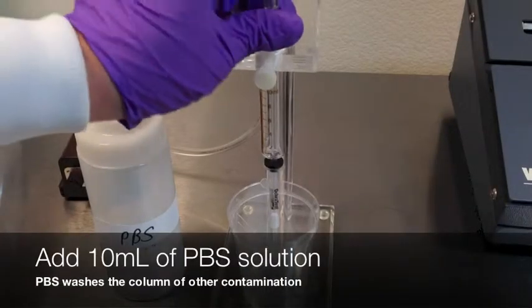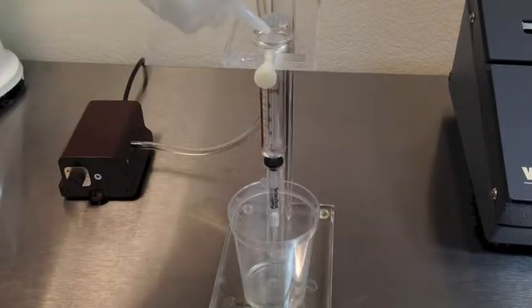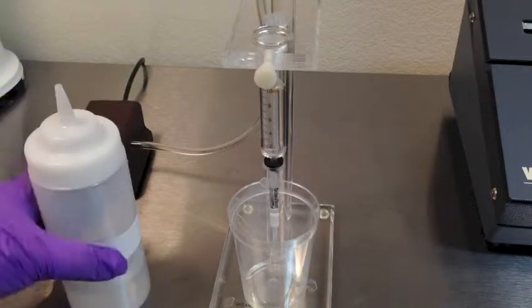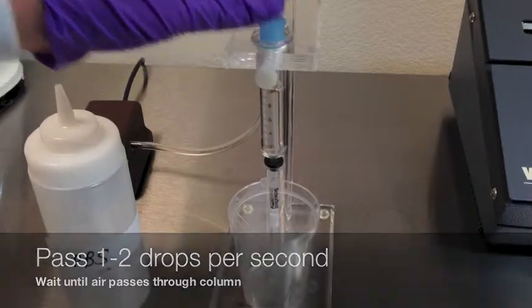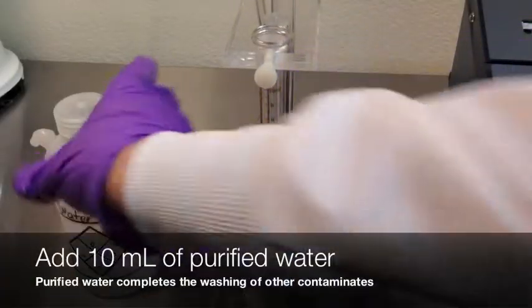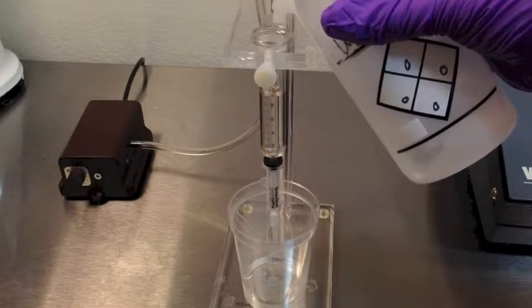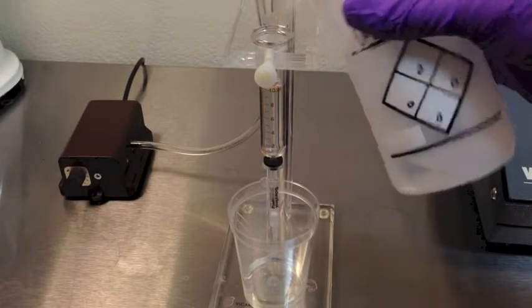Pass the extract through the column at 1 to 2 drops per second until air passes through. Then add 10 milliliters of PBS solution, using the syringe barrel markings to measure, and pass at 1 to 2 drops per second through the column. Then add 10 milliliters of water and pass through the column at 1 to 2 drops per second until air goes through.